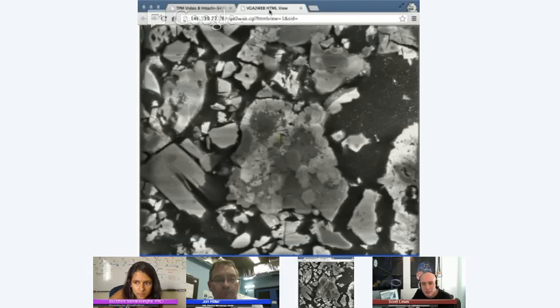Okay, there in the middle there is a crosshair. Right. And if I can direct your attention to the lighter contrast area, the bright stuff, those are calcium particles. Okay. And right directly south of that crosshair are two big round circles. That's aluminum. And these are what's called calcium aluminum inclusions. They are the oldest elements that we have been able to characterize. Basically, it defines t equals zero. Time is zero. Right. It's about 4.5 billion years old right there.